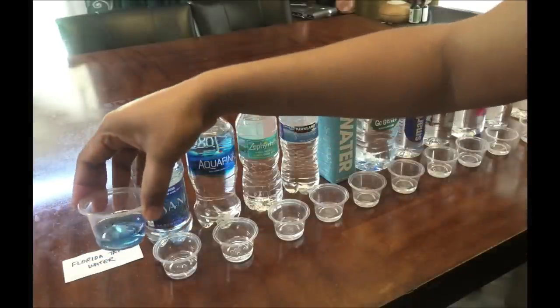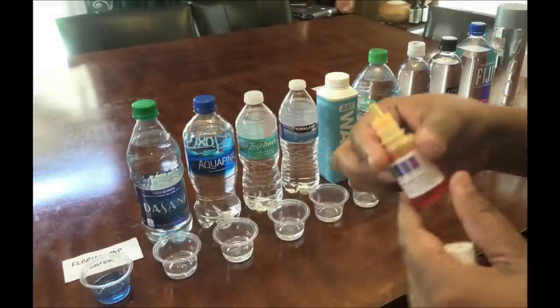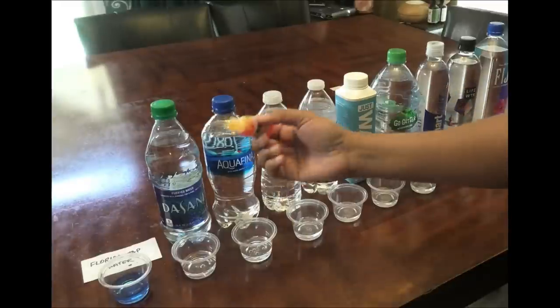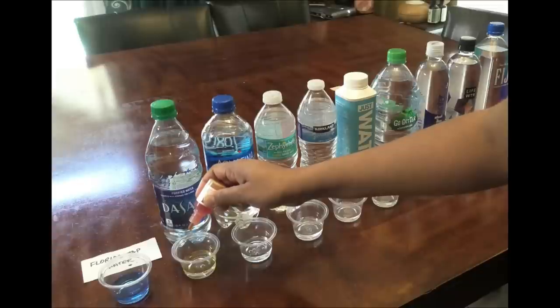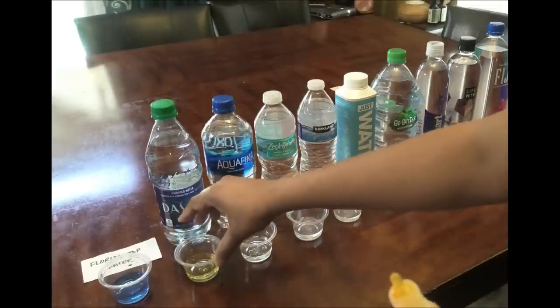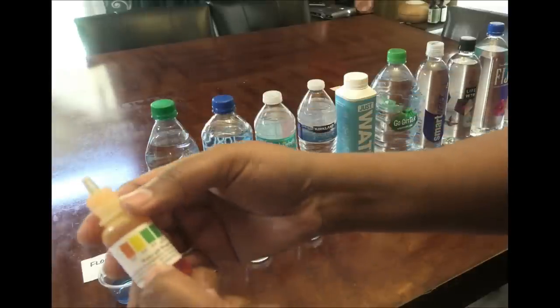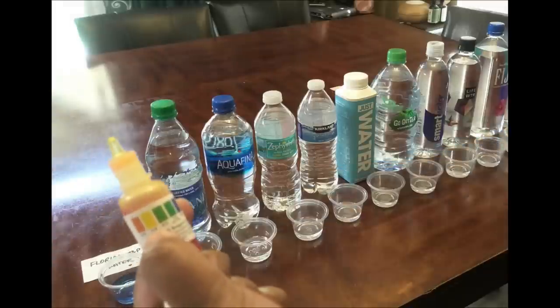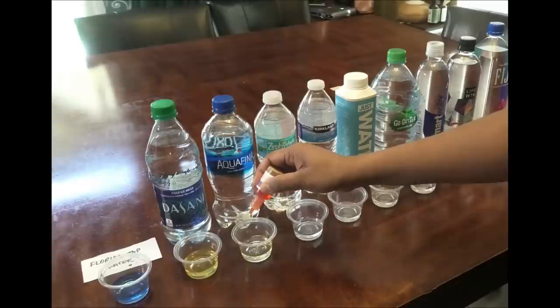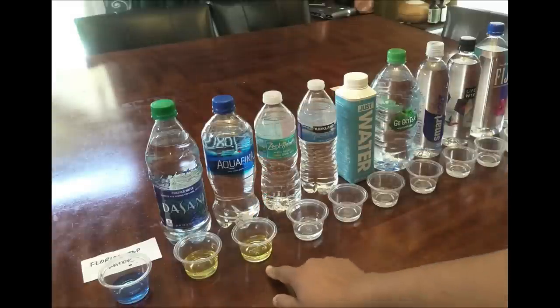The Florida tap water is already blue — not a dark blue, it's a light blue, but it tells me that it is alkaline. The next one is Dasani, and as you can see it has a yellow color, which means that it's acidic — that's a pH of 5.0.